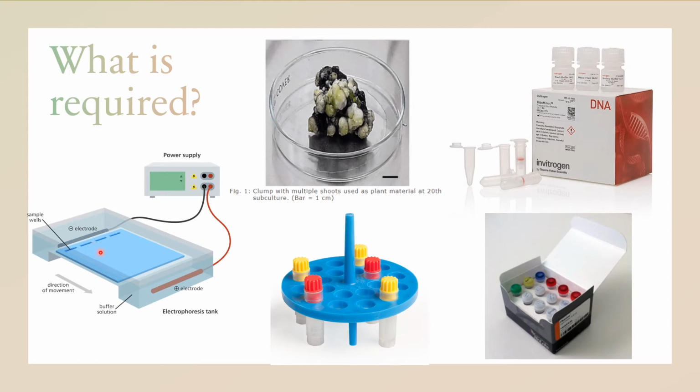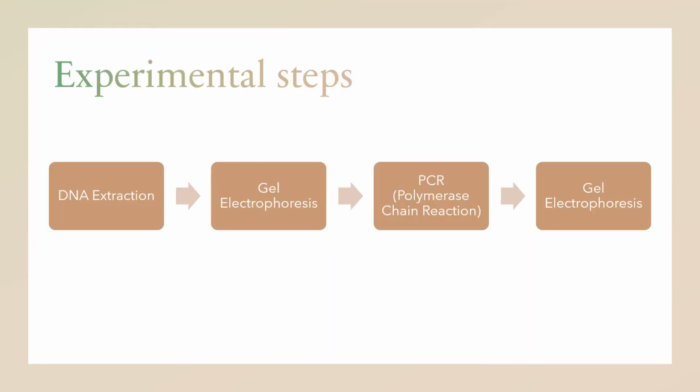So the smaller one will actually move faster than the bigger one. So basically, the experimental setup for the whole experiment is just as summarized in this chart right here.